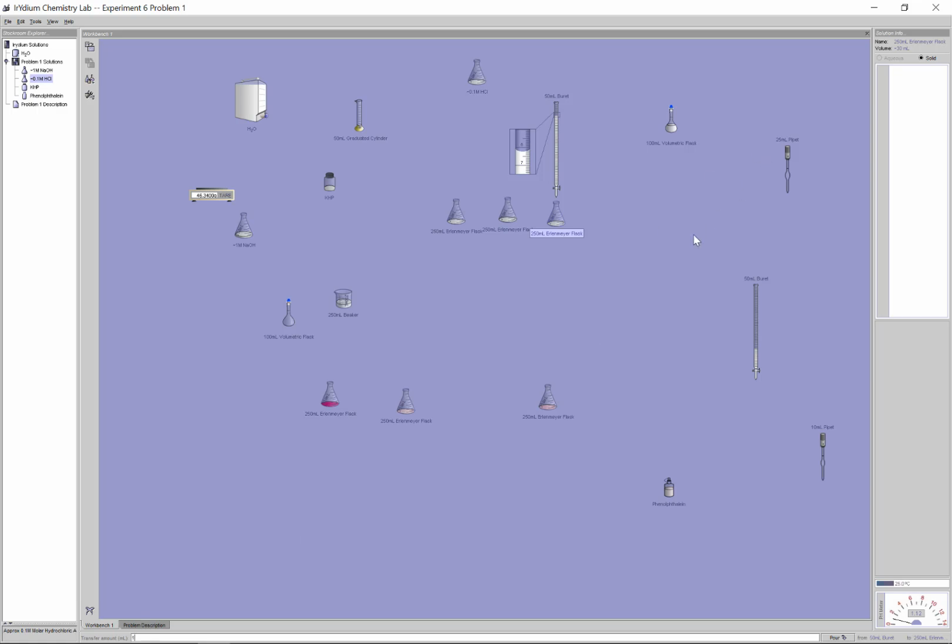Again, your first titration is just an approximate value here. So you just pour it in. 1, 2, 3, 4, 5, 6. You don't need to keep a good count of it because the burette here actually has the volume marking on the side. What you want to do is you want to stop at the first instance where the pink color shows up. So because I had 25 milliliters in the Erlenmeyer here, I'm actually using quite a lot of my burette. You notice I'm down to the 39, 40 mark here. That one there would have been overshot. It's overly pink. There's excess base, but at least it gave me an approximate of what it's going to be.